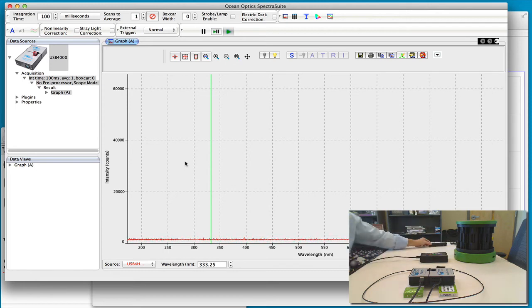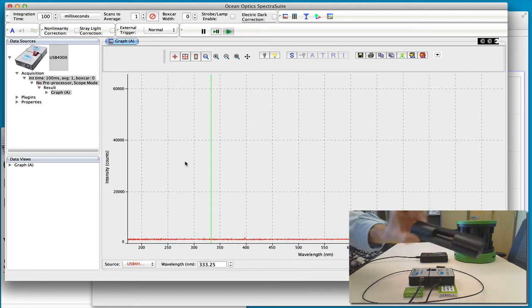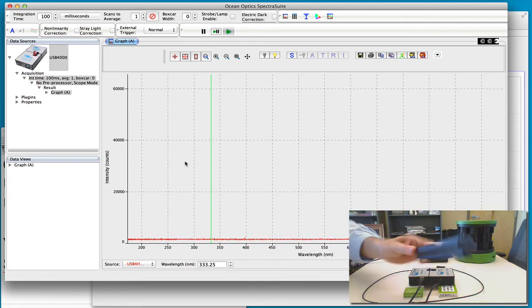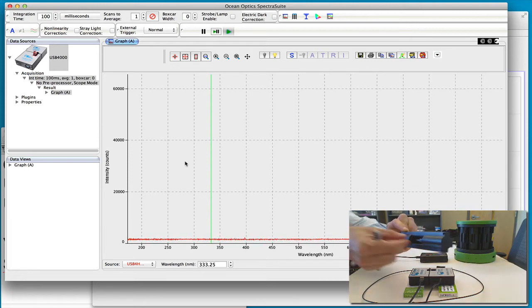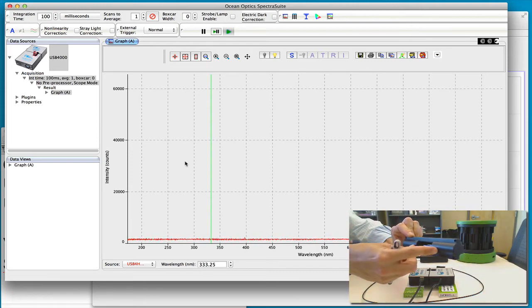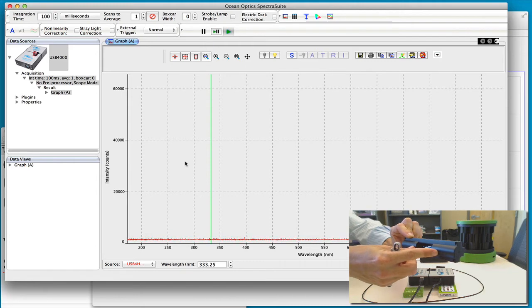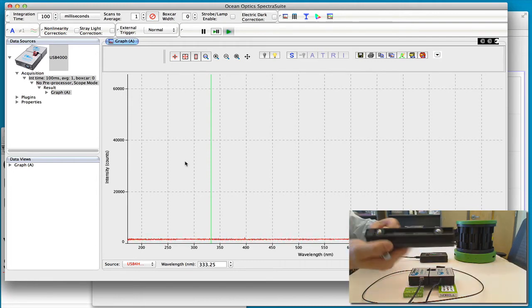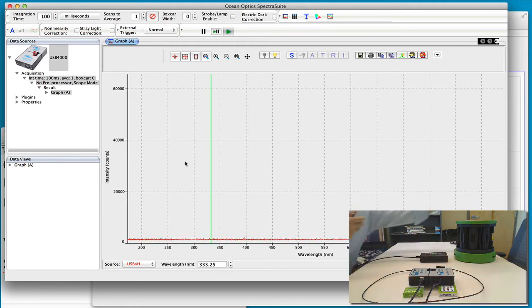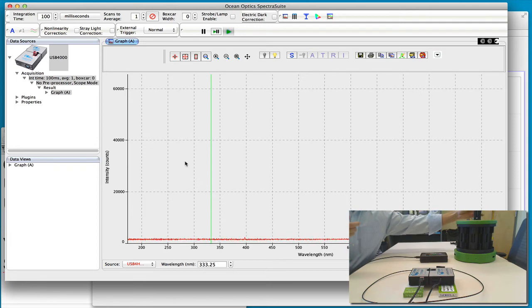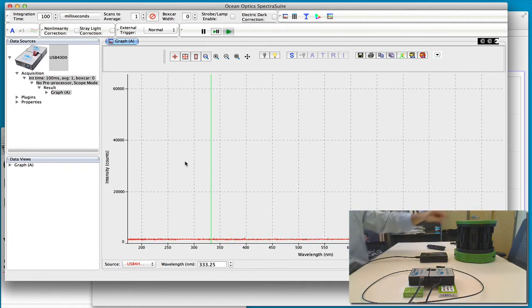The tubes generally look like this. You can buy single tube sources as well, but it's just passing a high voltage through a glass filled tube that contains the gas of interest. This one is nitrogen and you can flip it into this carousel like that.